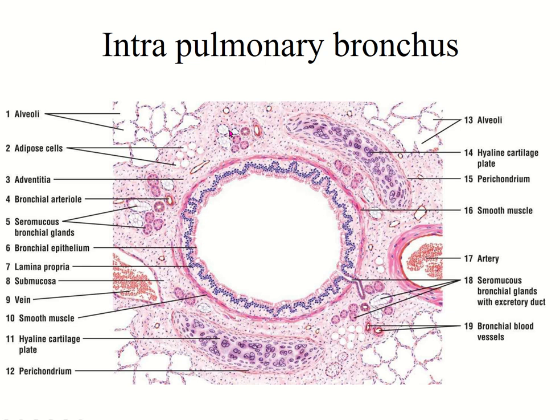Nucleus is flattened because the thick secretion is accumulated in the apical region and pushes the nucleus to the periphery. And some occasional cap-like serous cells are present on the mucous acini. This is known as the serous demilune.